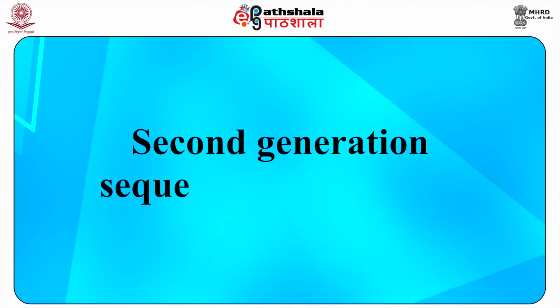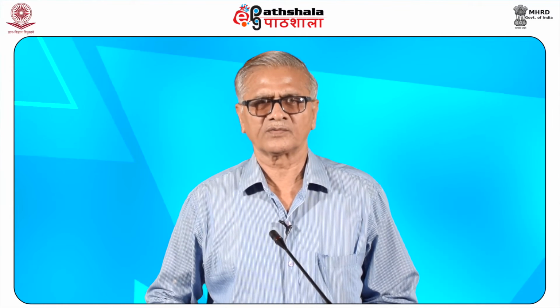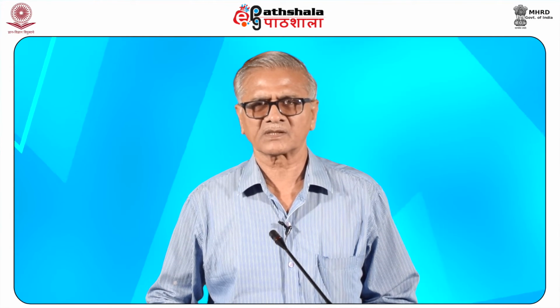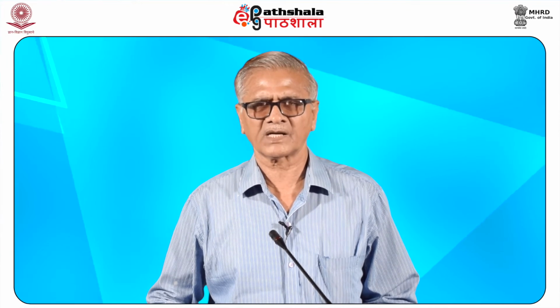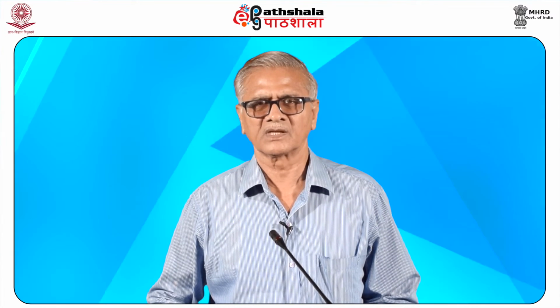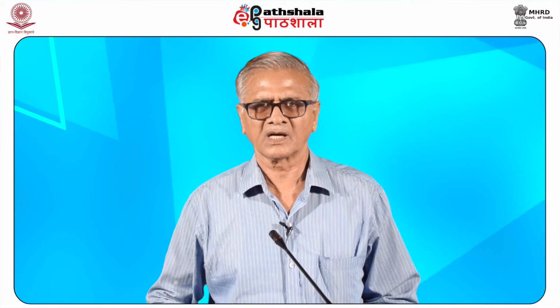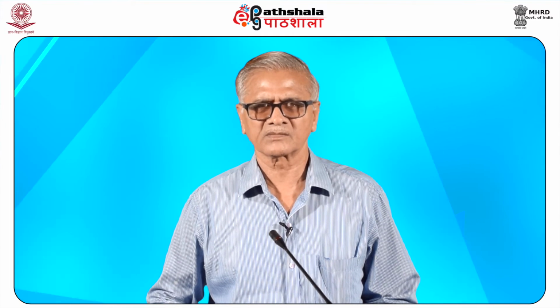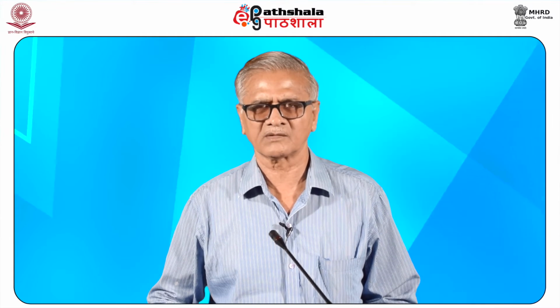Now we come to second generation sequencing techniques. The key feature of second generation sequencing methodologies is parallelization of a high number of sequencing reactions achieved by miniaturization of sequencing reactions, highly improved detection systems, and reduction in cost and sequencing time to hours.